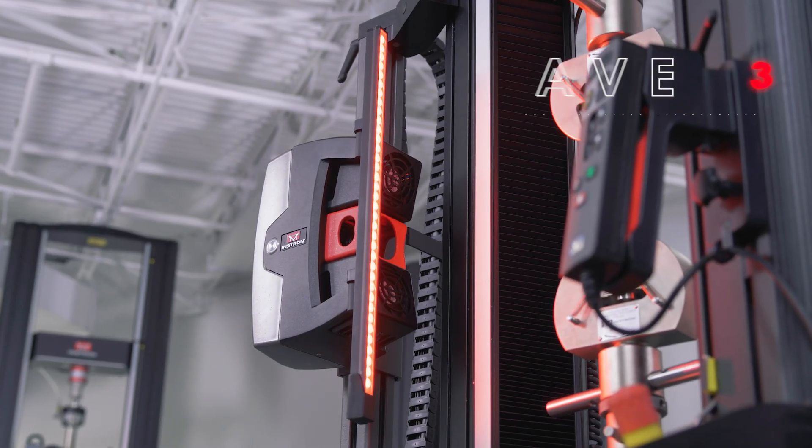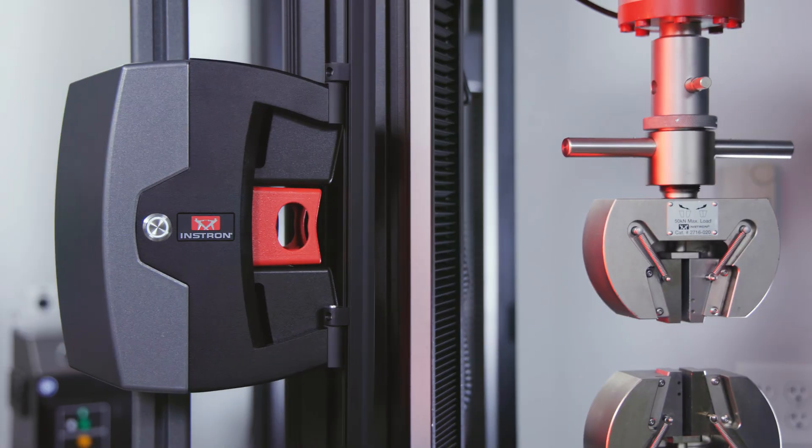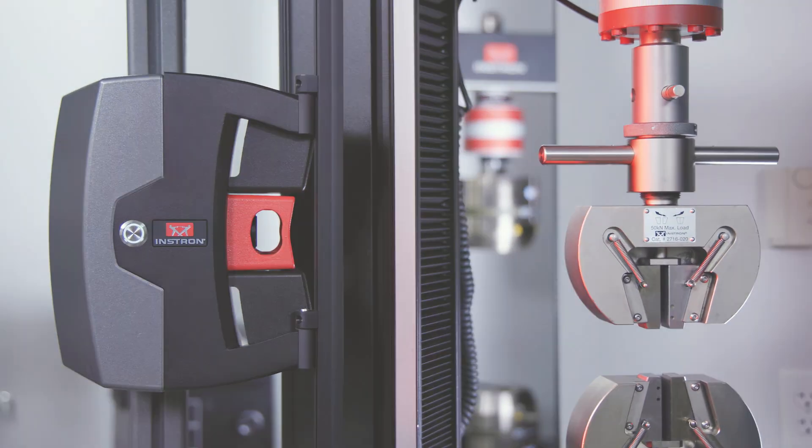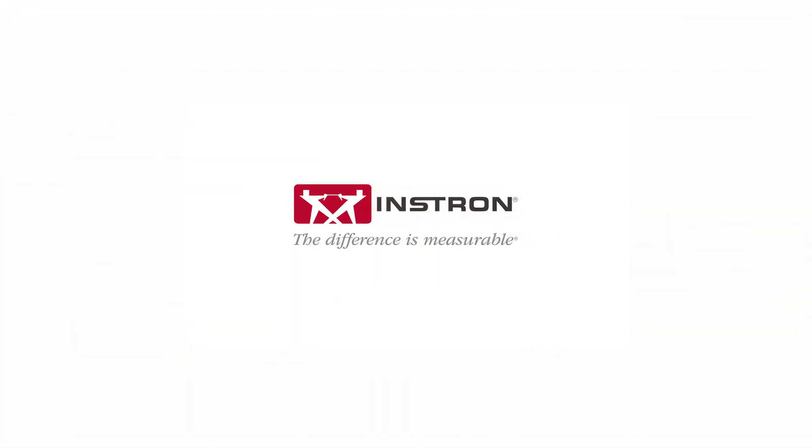The Instron AVE-3 Advanced Video Extensometer is a non-contacting strain measurement solution designed to support the evolving demands of materials testing and meet stricter customer requirements by delivering exceptionally accurate data in any lab environment. Instron — the difference is measurable.